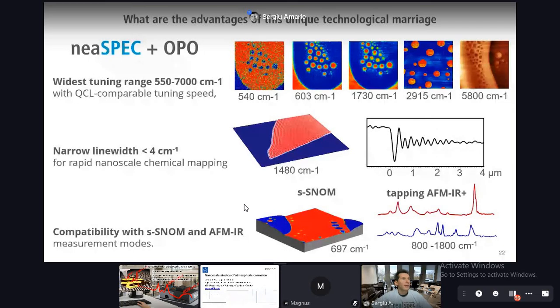And indeed, when you want to move to a different wave number, you need to tailor the reference modulation of the detection module. The larger the wavelength, the more you need to modulate that mirror. That's, however, done automatically, and that started with the new generation software. I believe software 1.8, 1.7.